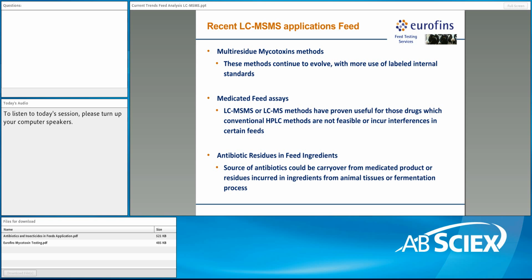Not included in this discussion today are emerging or unknown non-targeted contaminants, which are reserved for another discussion in itself. But the first part of the discussion will concentrate on multi-residue mycotoxin methods, which we see continuing to evolve, and of course with the use of more labeled internal standards. Medicated feed assays, use of LC-MS or LC-MS/MS methods are evolving in these work areas.